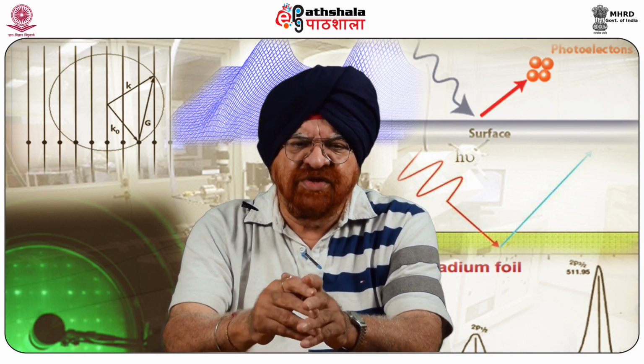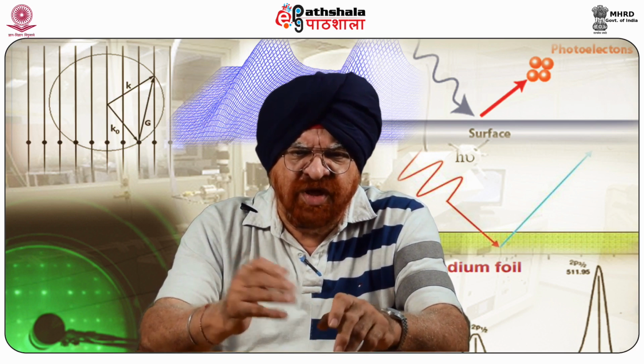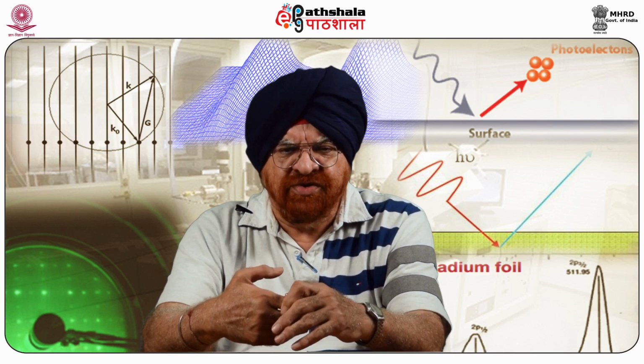The sensitivity of this is also very high. Concentrations down to about 0.1 atomic percent can be measured, can be detected. Surface specificity is another benefit, wherein less than 10 nanometers of material, if it is there, one can find out with the help of ESCA. Then the biggest advantage is in terms of ease of analysis. Minimal sample preparation time is required, and you can really get very accurate results.